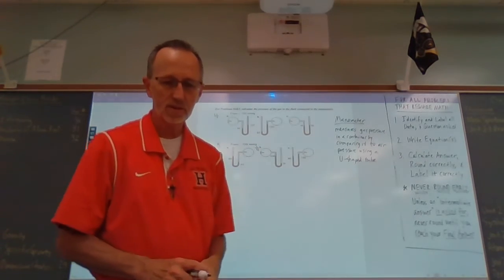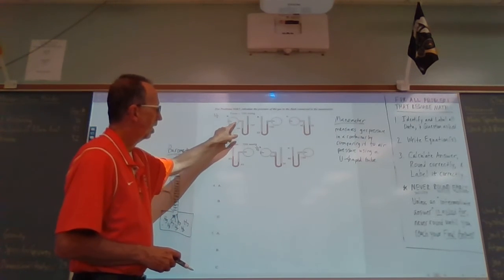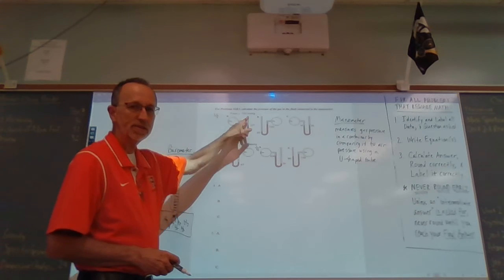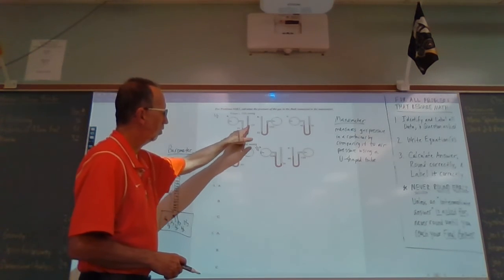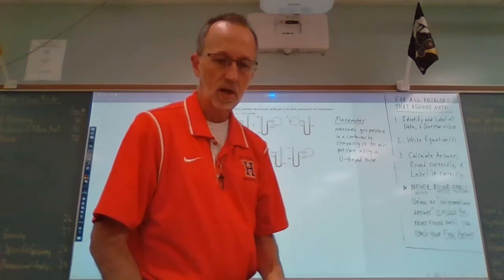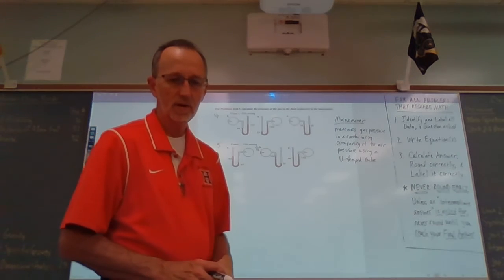Now here's what I want you to understand, how this thing works. So the gas is in this container here, and it's connected by an opening to this U-shaped tube. And then the other end of the tube is open to the air. And then again, we have mercury in this tube. So here it's showing the air pressure is 730 millimeters of mercury.